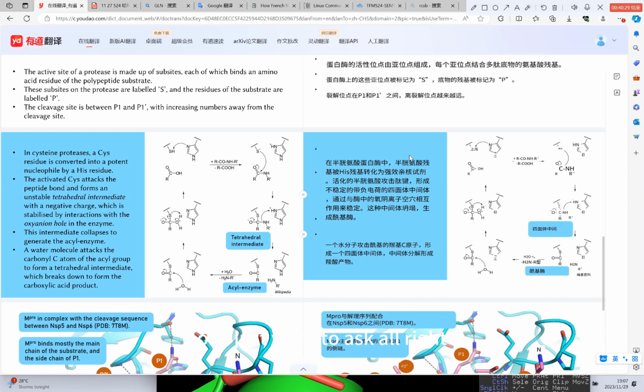I just want to ask. Alright, so can you see? Do you know which is the N-terminal? Of course I know already. The N-terminal is here. So can you guess which is the P1 side? For this, just now we saw the histidine. The histidine is here, and then histidine is here. Then the cysteine is supposed to be here, right?